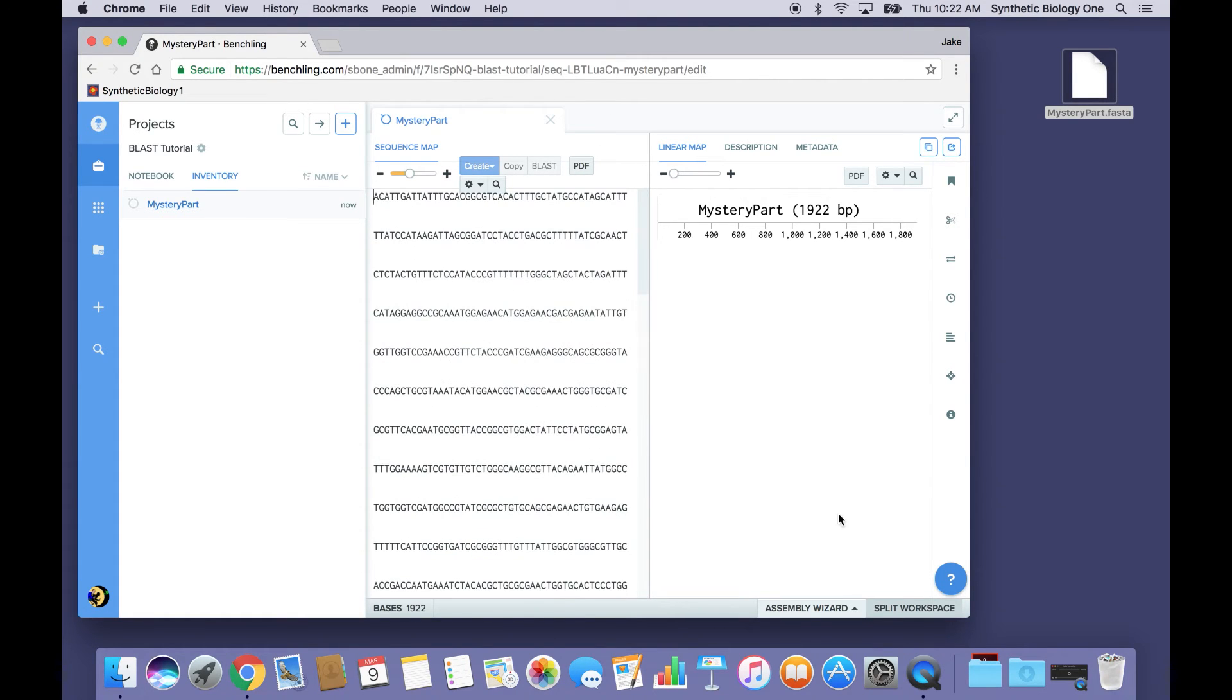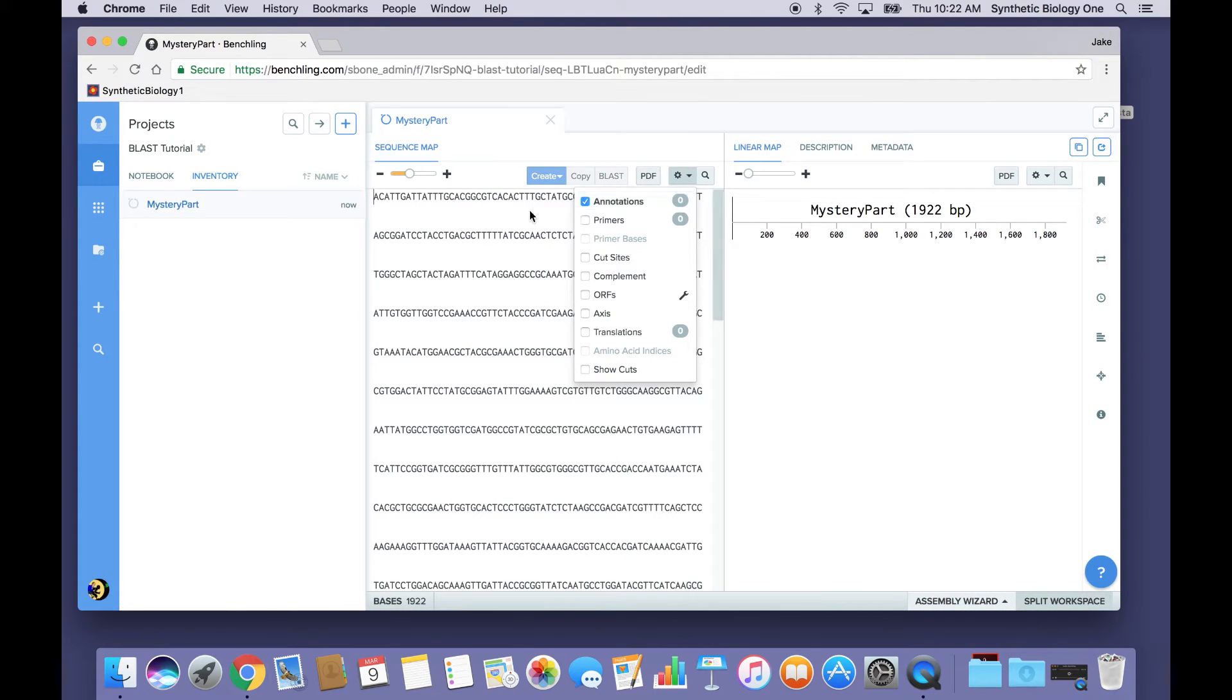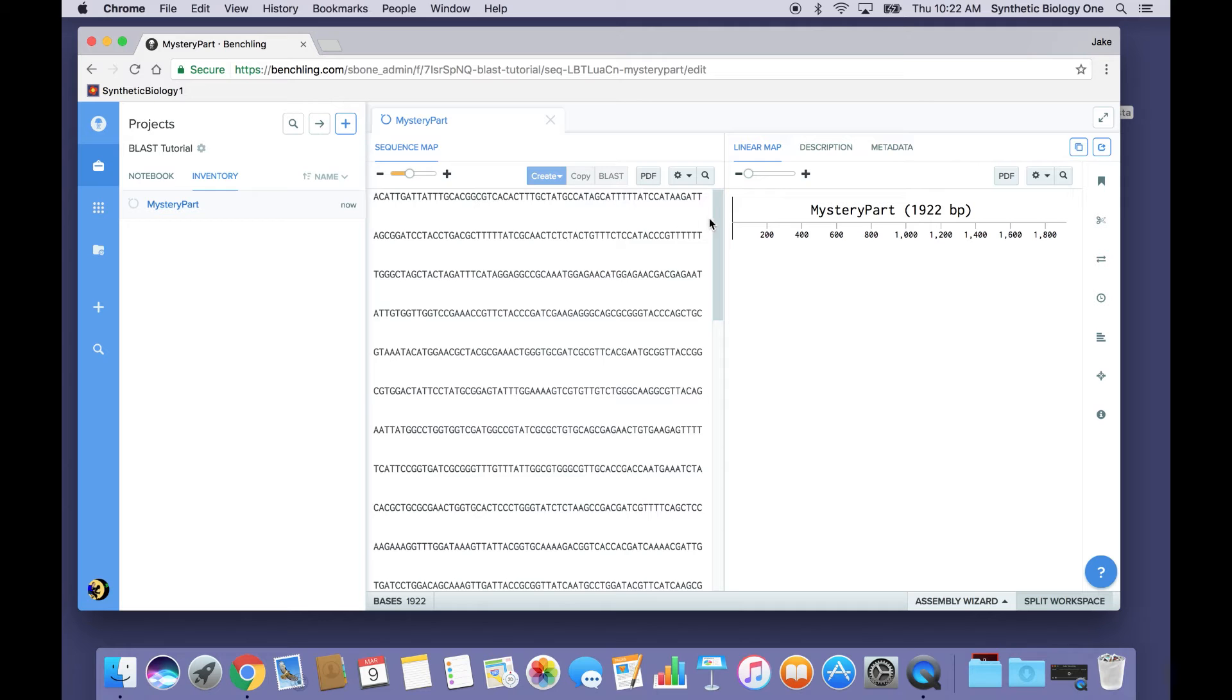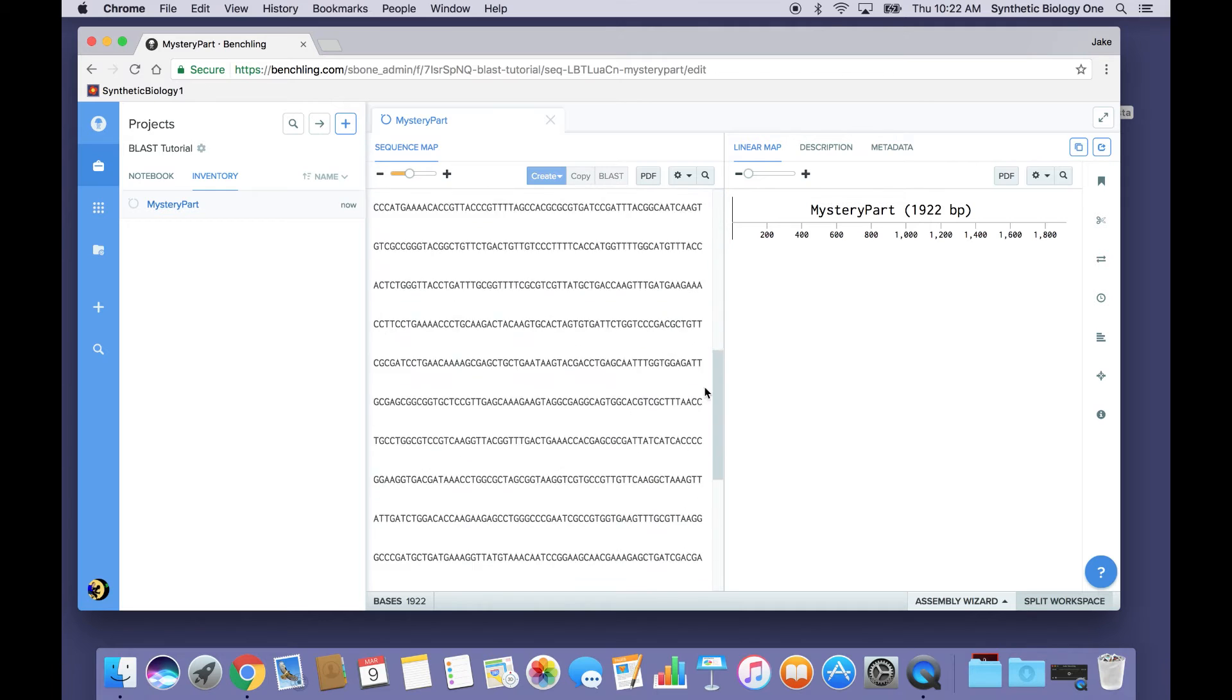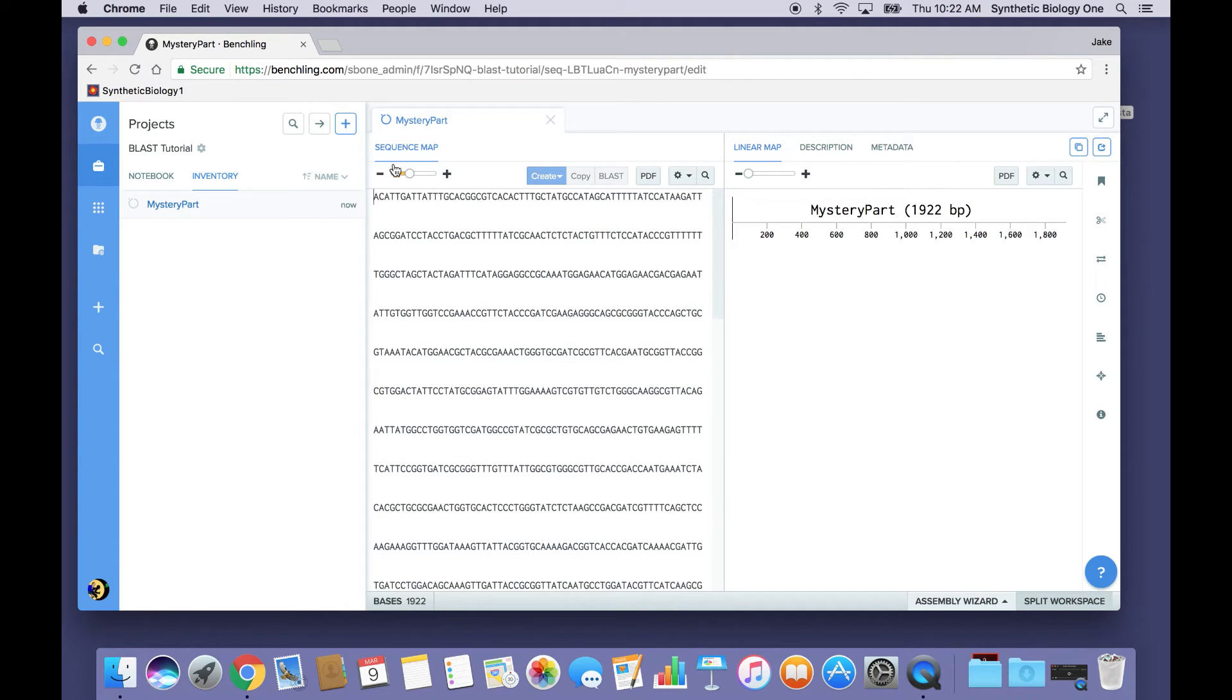And as you can see, if I go here, for example, and turn on annotations, there are no annotations known for this part. Nobody knows anything about it.